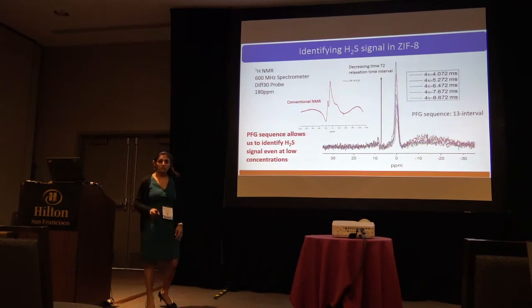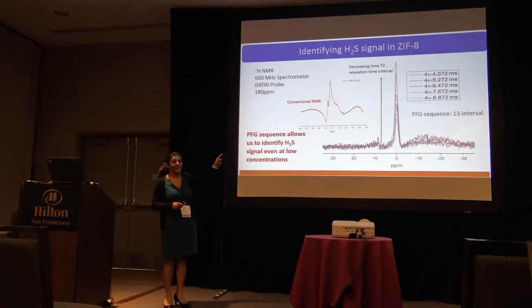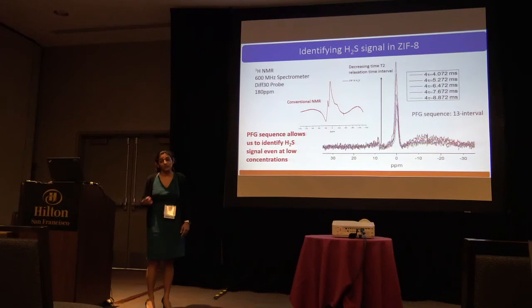And this is unconventional already because you don't usually use proton NMR with high magnetic field for diffusion studies in porous materials because you get something like what's shown up there in red. It's a really broad peak. You can't figure out what's what in that. And the reason for that is a lot of anisotropy effects.